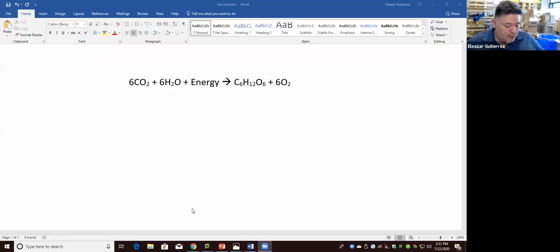Okay, so we're going to be hitting the chapter on photosynthesis in a week or two, but that's okay. This lab will help us understand it a lot better. Okay, and I'm kind of excited about this. I've heard about this experiment before, and I've wanted to do it, and here I am. I found it.